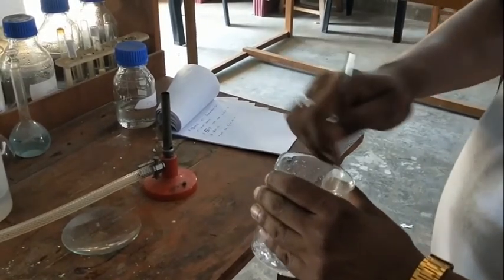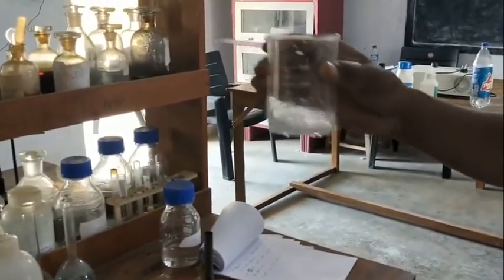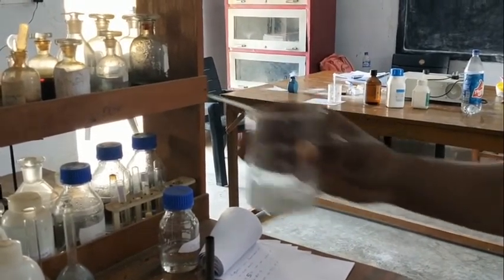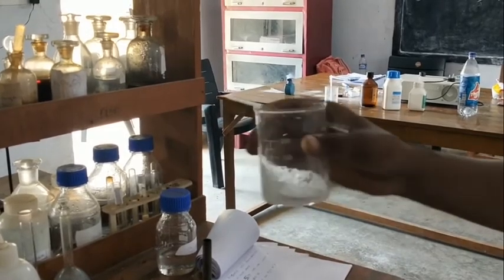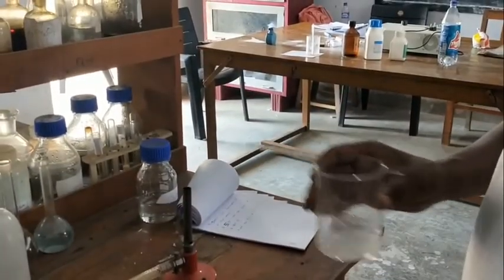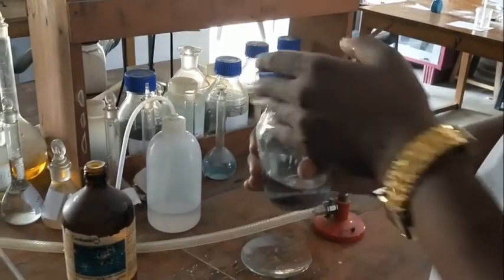We will stir it till it dissolves. Stir. Now a little amount of sulfuric acid is added to it.